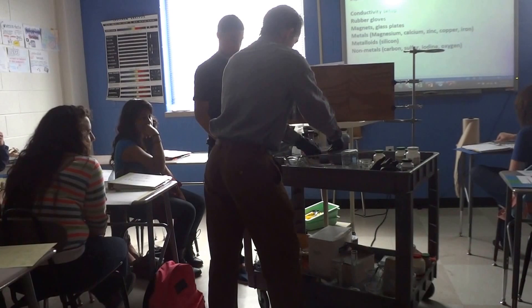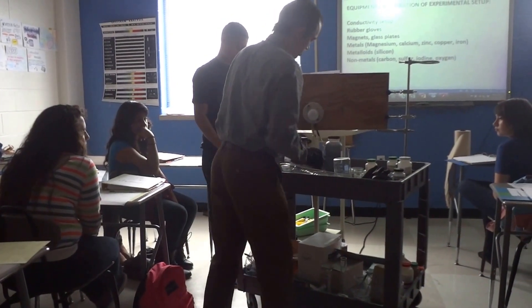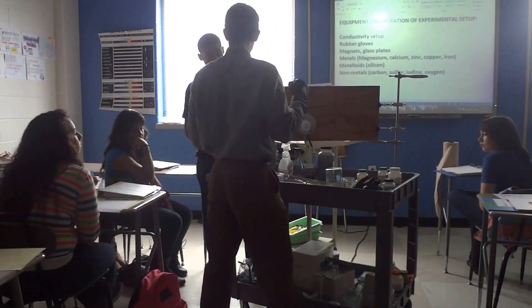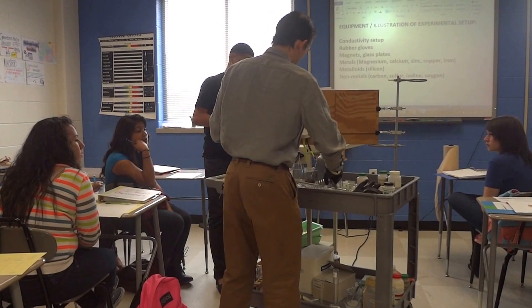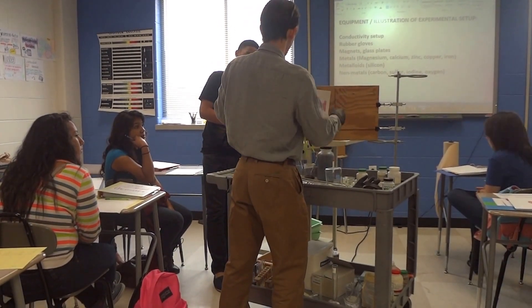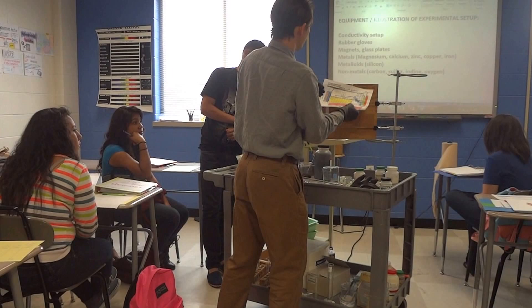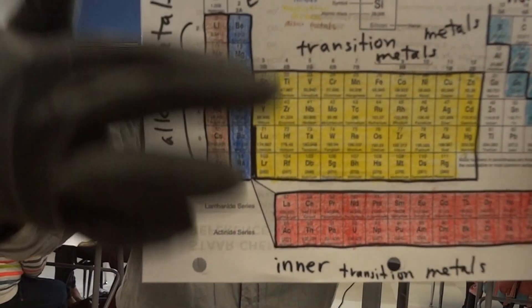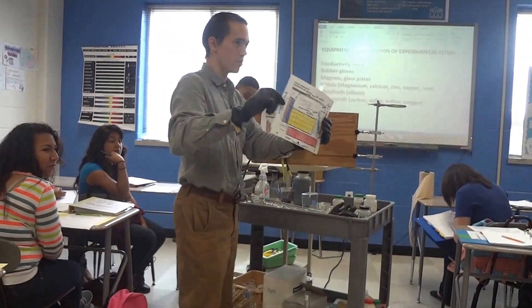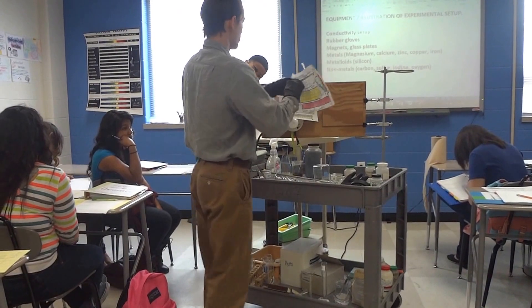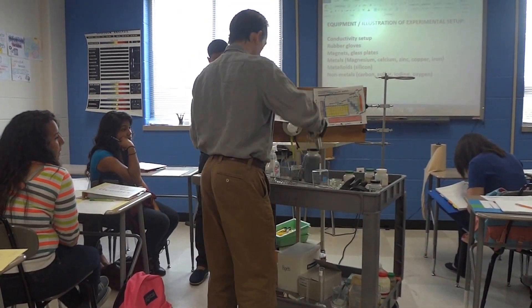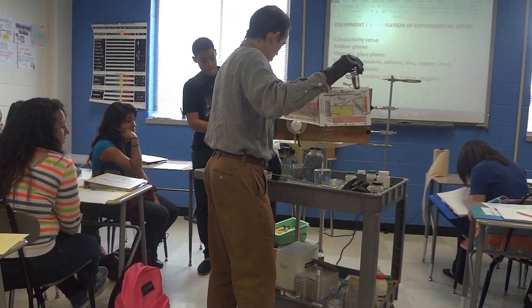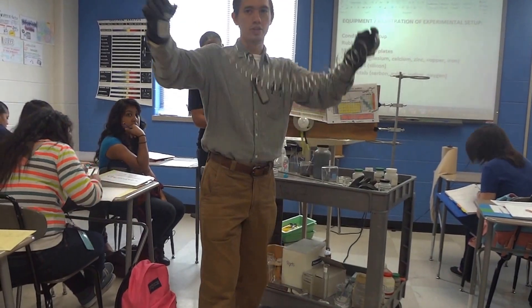Now we're going to test for conductivity of different metals. We're going to start with magnesium and go across the periodic table from left to right. I don't have any alkaline metals, but I do have alkaline earth metals — those are the second most reactive group. So we're going to start with magnesium. Observe the physical properties and write them down.